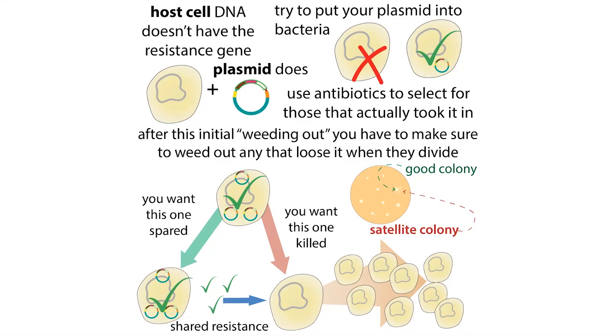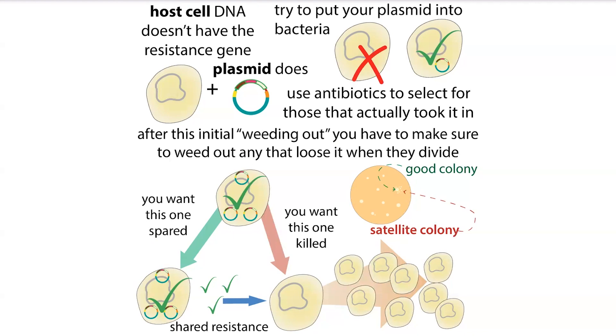In liquid media, cells are all mixed together, and those that would have been satellite colonies are going to have a growth advantage and can outgrow the bacteria that actually have your plasmid. It might not be as big of an issue in liquid culture because the beta-lactamase gets diluted out more. On a plate, you get a really high local concentration of beta-lactamase right around that colony — which is why satellite colonies grow right around that big colony rather than spread out all over the plate. In liquid culture, the beta-lactamase gets diluted over the entire volume, so it's helping everything but less, whereas with the plate you're helping only the nearby things but helping them a lot.